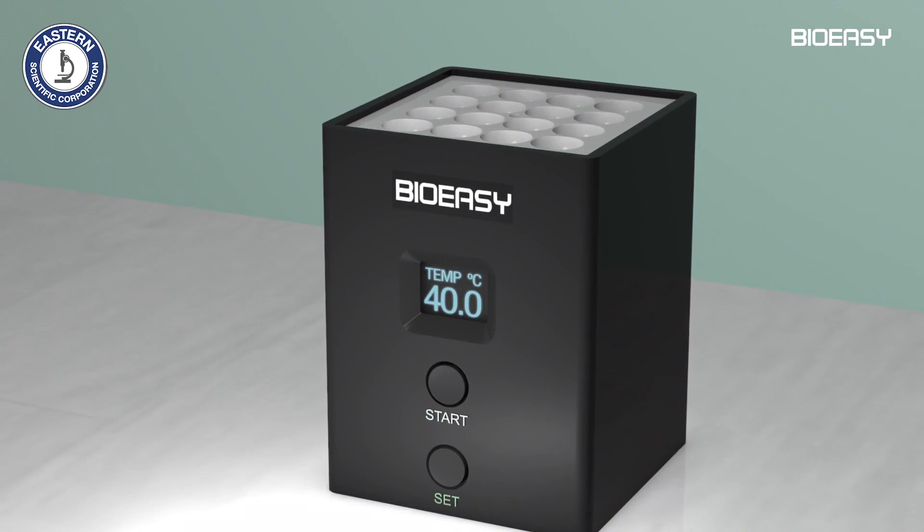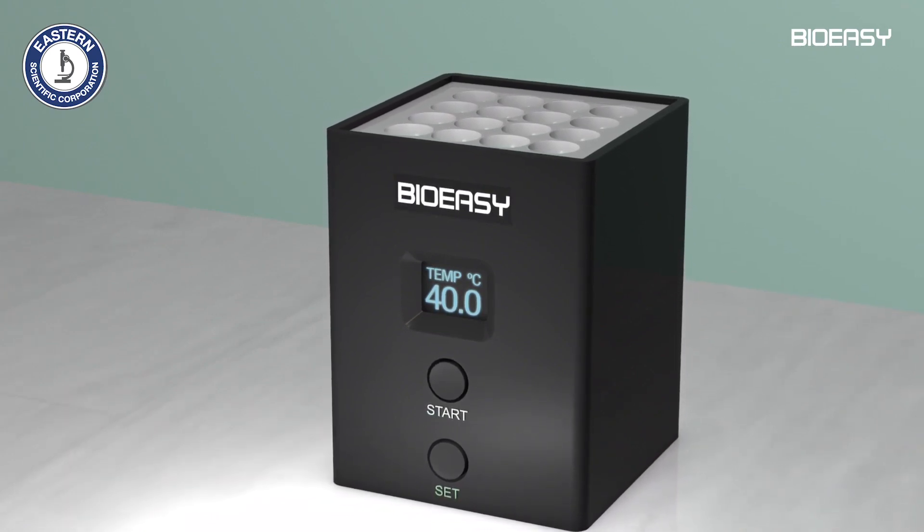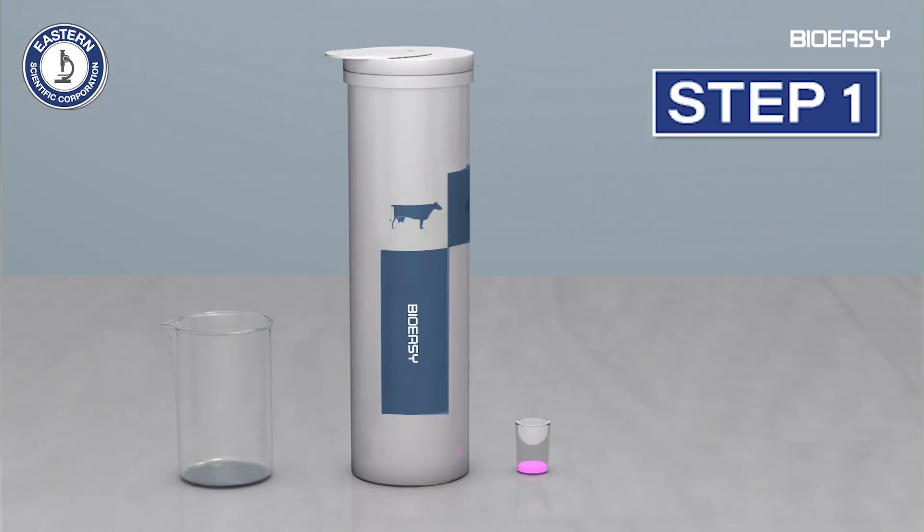To conduct the test you need one incubator capable of maintaining a temperature at 40 degrees Celsius. Connect the incubator and wait until the temperature has stabilized at 40 degrees Celsius.